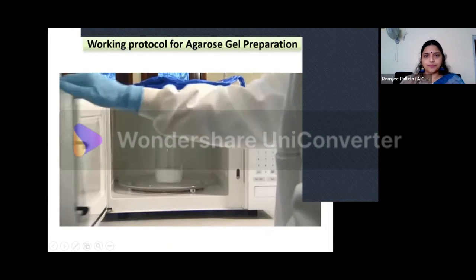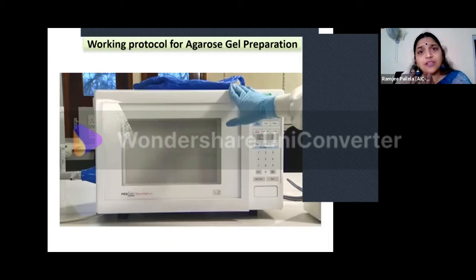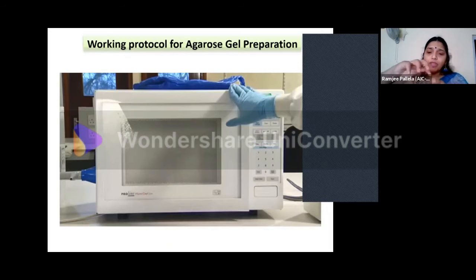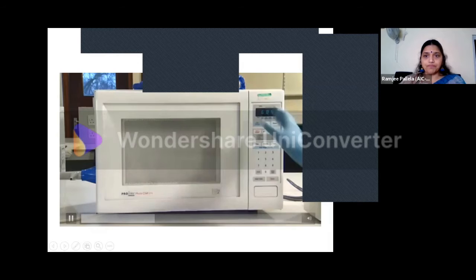It's very important that this cover be loose. You heard that? It is very important for the cover to be loose. You remember, you must have done this autoclaving as well, right? In microbiology or cell biology, media or something. What we do is, we don't tighten it properly. Why? Because of the heat that will be generated, the vapors that are coming out, chemistry. I told you it's all multidisciplinary. So when the vapors come out, it should not blast the substance. Otherwise, dangerous pressure buildup can occur within the container.